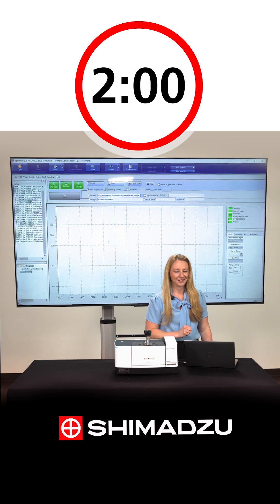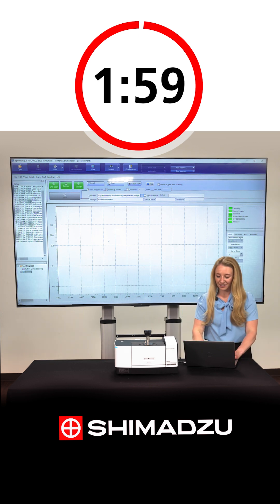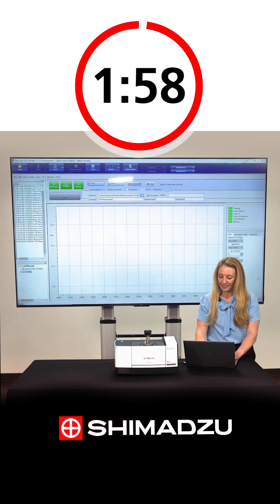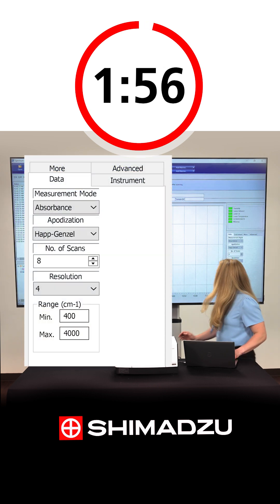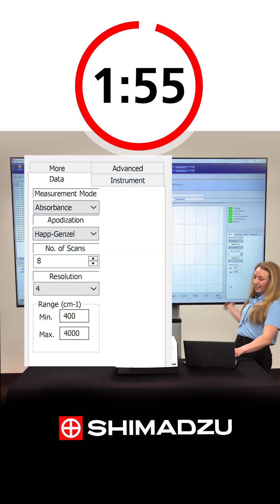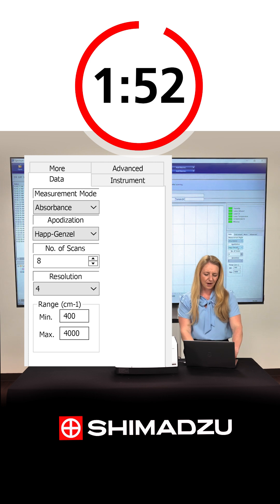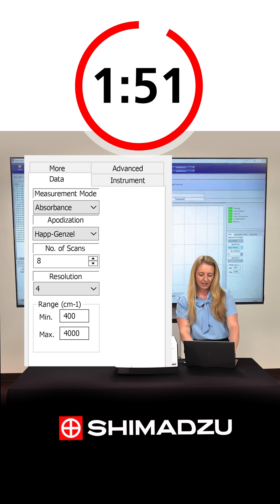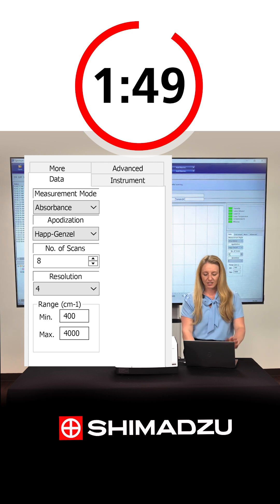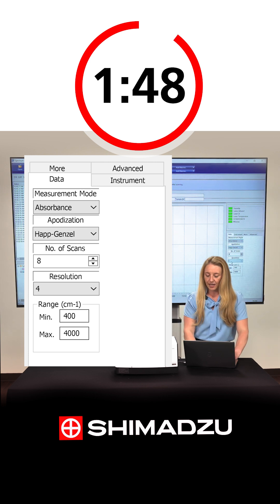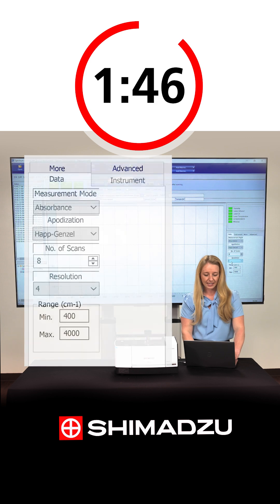Three, two, one, go. So first, I want to select what parameters we're going to use today. I'm going to select absorbance, apodization is fine, number of scans — eight should be good for today — and a resolution of four is usually standard.